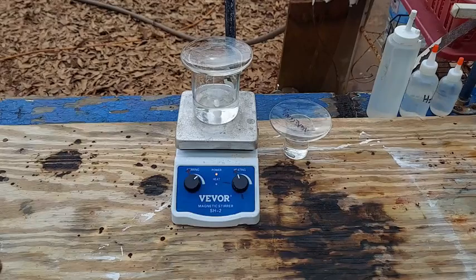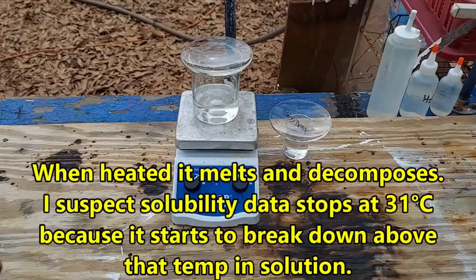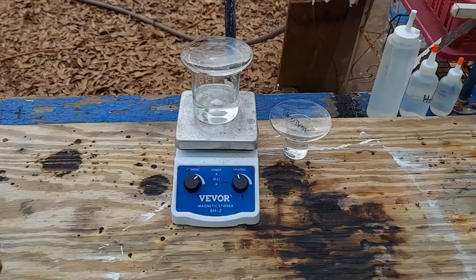Thallium cyanide is not the most stable compound in the world so you definitely don't want to get it too hot. It will not melt - it will decompose. I could only find solubility data up to around 30-something degrees C, and I imagine beyond that it stops because beyond that it breaks down. I don't know that for a fact but I suspect that is the case.